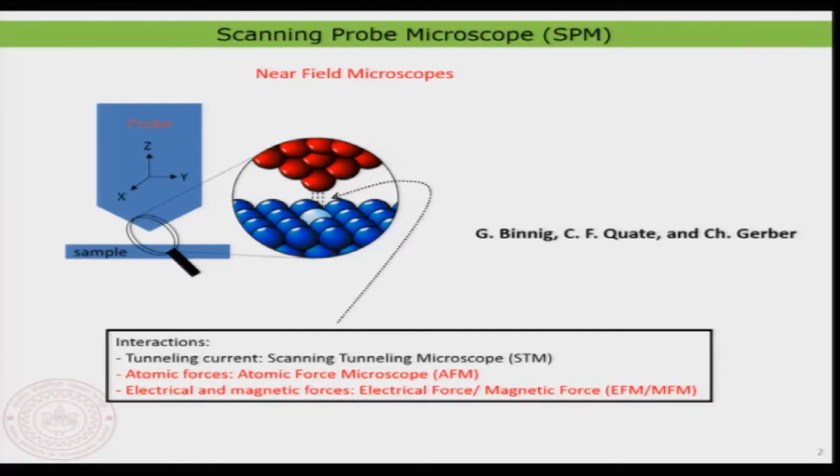So, I have already shown you an image in the previous class about atomic force microscope, but now you are going to see it in greater detail. Yeah, good. So, it again comes under the bigger family of scanning probe microscopy. That is something we have already talked about.